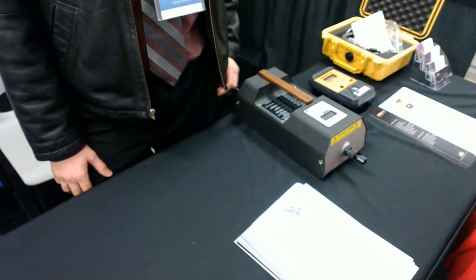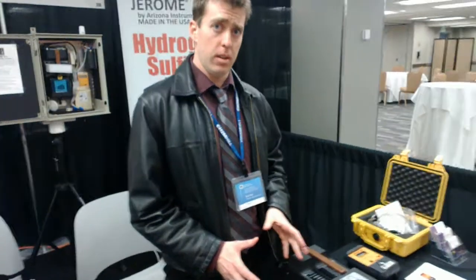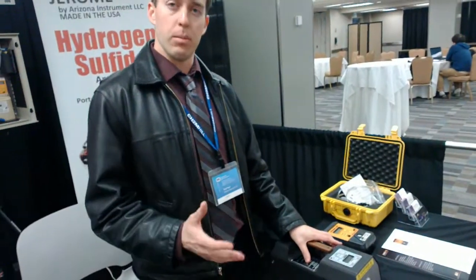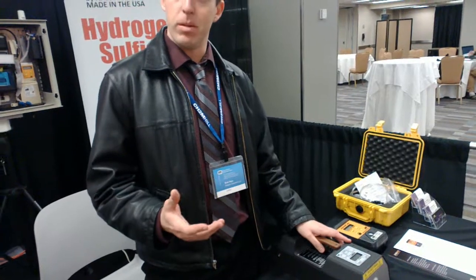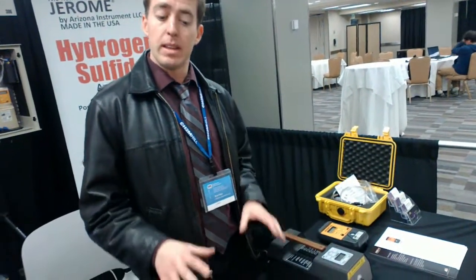Why is this equipment, this Jerome meter, better than your competitors? Well, this instrument uses a gold film technology. What that means is that inside this instrument, instead of using a chemical cell, we're using a gold film. The gold film allows us to read much lower, so that's why we're able to get the low parts per billion — three parts per billion — down to 20 parts per trillion. That's mainly the secret for that.